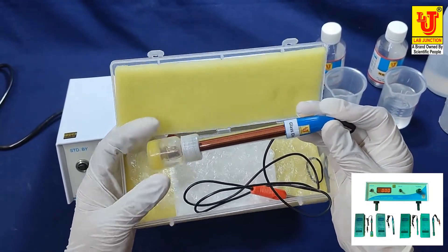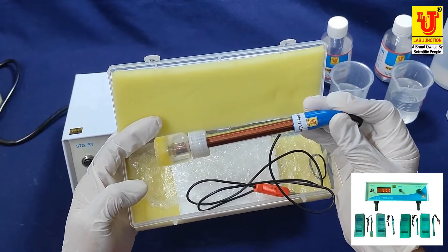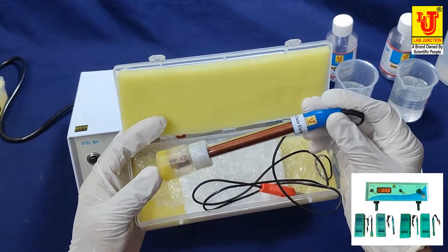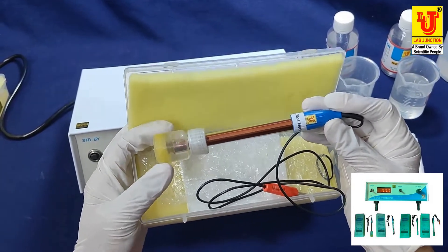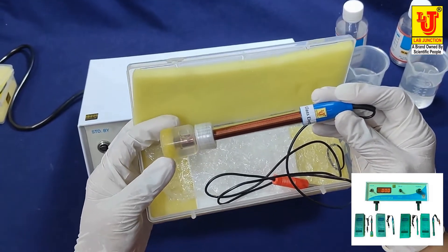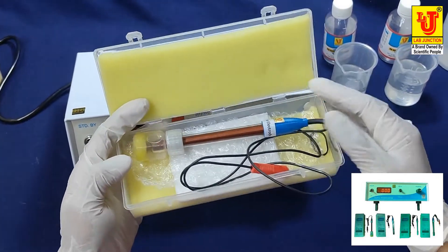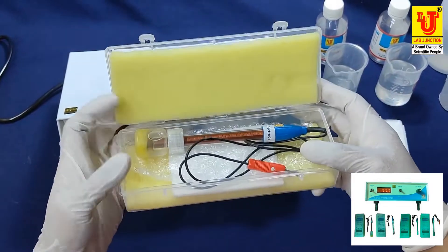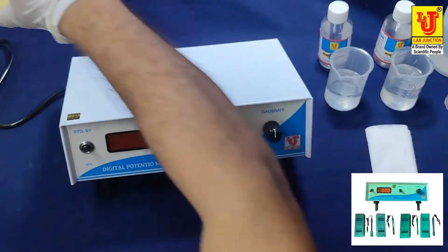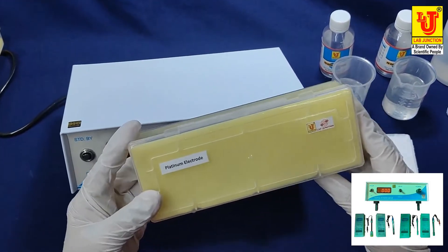The glass electrode is supplied with a charger capsule bottle. When you need to use this electrode, please remove this charger bottle — it is only used for storage purposes to preserve the electrode life.